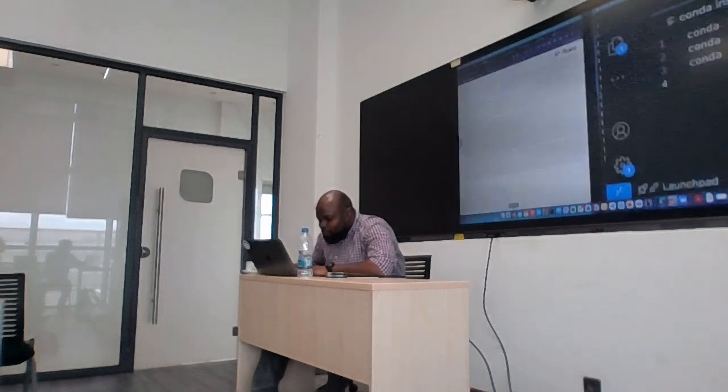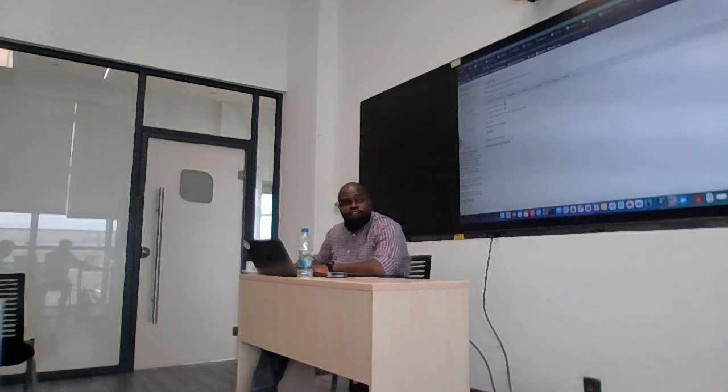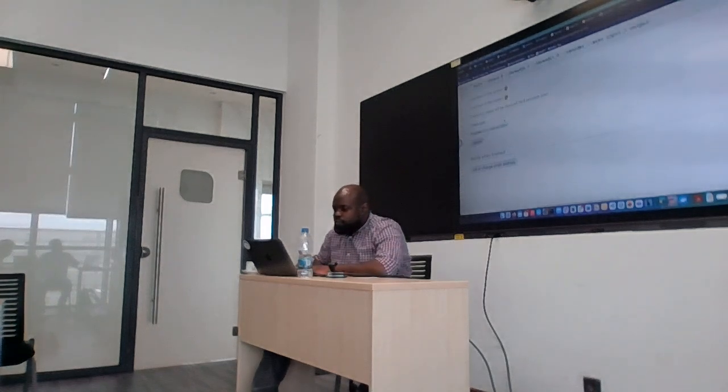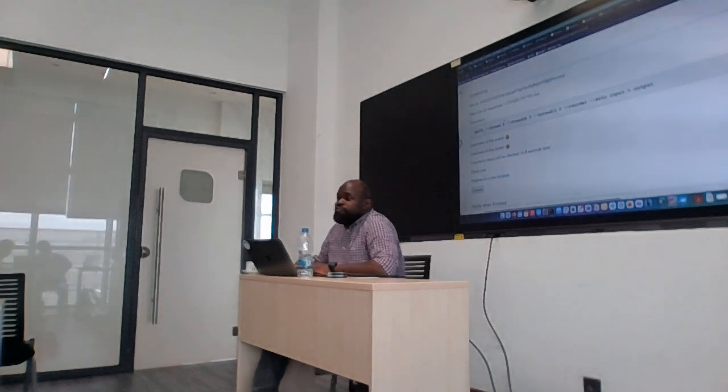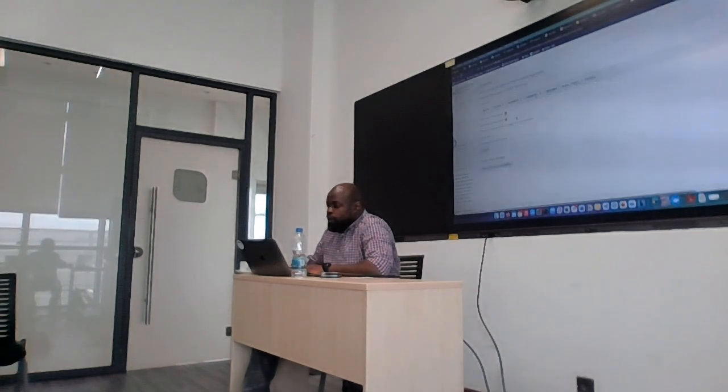All right. So we've installed MAFFT. You can see, if I just zoom in on the MAFFT server, I gave it a set of sequences, and it's even telling me the command that it has used to do the alignment. Okay? All right, so we are going to do our own alignments on the command line.